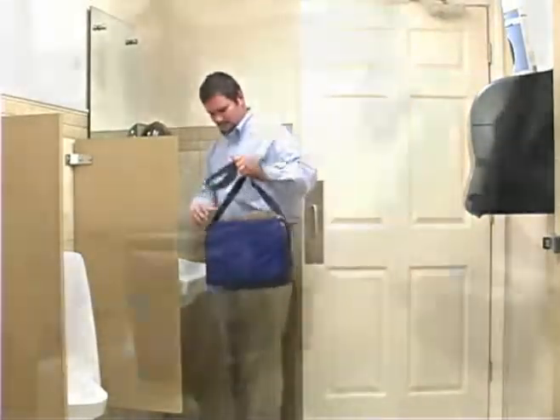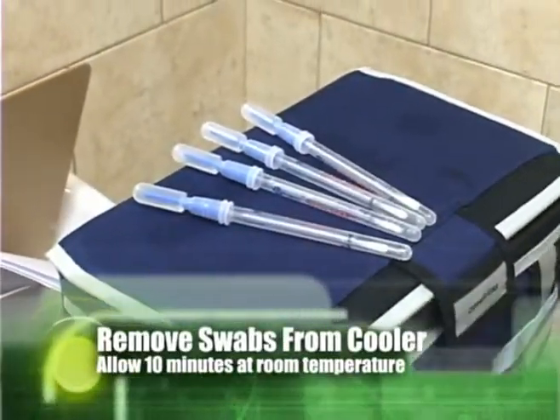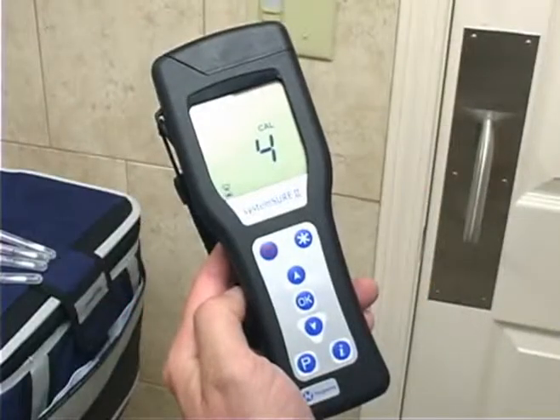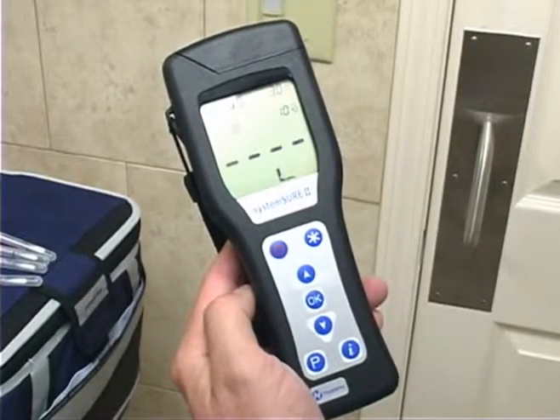To begin testing, remove swabs from the cooler and allow 10 minutes at room temperature before using. Turn on your ATP meter by pressing the red power button. When the unit powers up, it will perform a self-test and calibration process which takes 60 seconds.